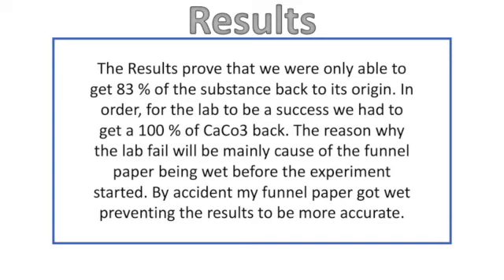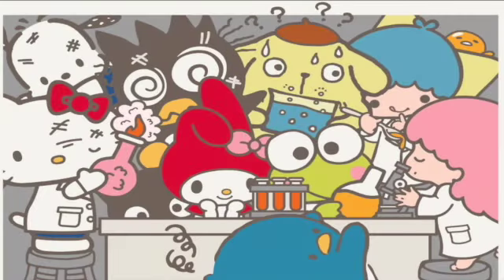The funnel paper got wet before using it in the lab, in which it must have caused a mistake while transferring substance. In order not to make the same mistakes again, I'll make sure to know my materials better and read more carefully the instructions.